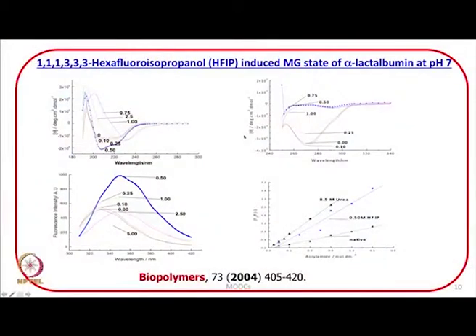If we look at the upper panels, these are the far UV-CD and near UV-CD spectra of alpha lactalbumin in presence of different concentrations of hexafluoroisopropanol.